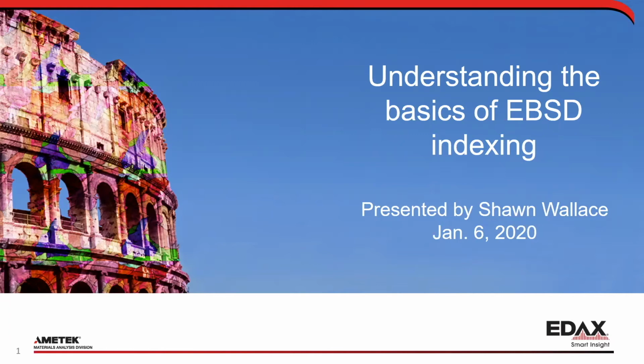This is more true for the CCD-based cameras than the CMOS, and we'll talk about that in the 1030 presentation. But ugly is indexable. So if I have an ugly pattern, you'd be surprised how low quality can you go? It does depend on the material and other things, but lower than you're most likely to believe me. And I'm going to try to convince you again that ugly patterns work.